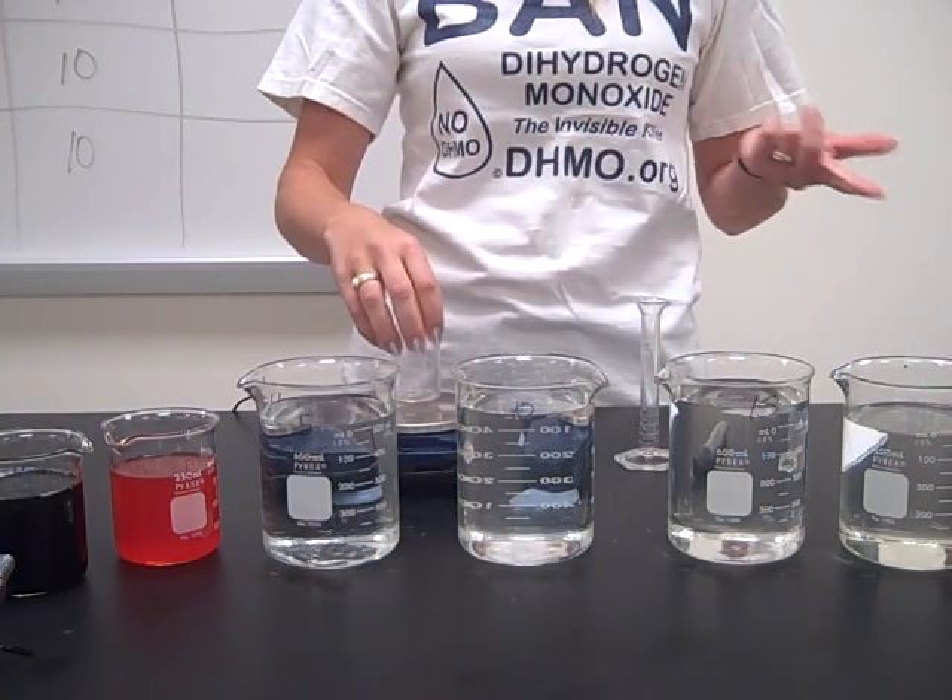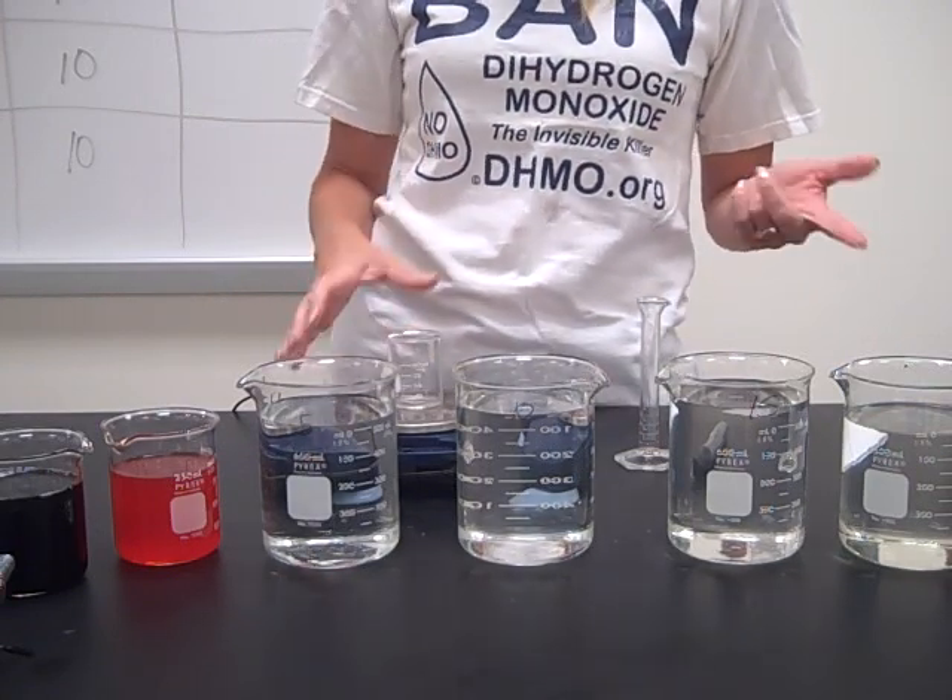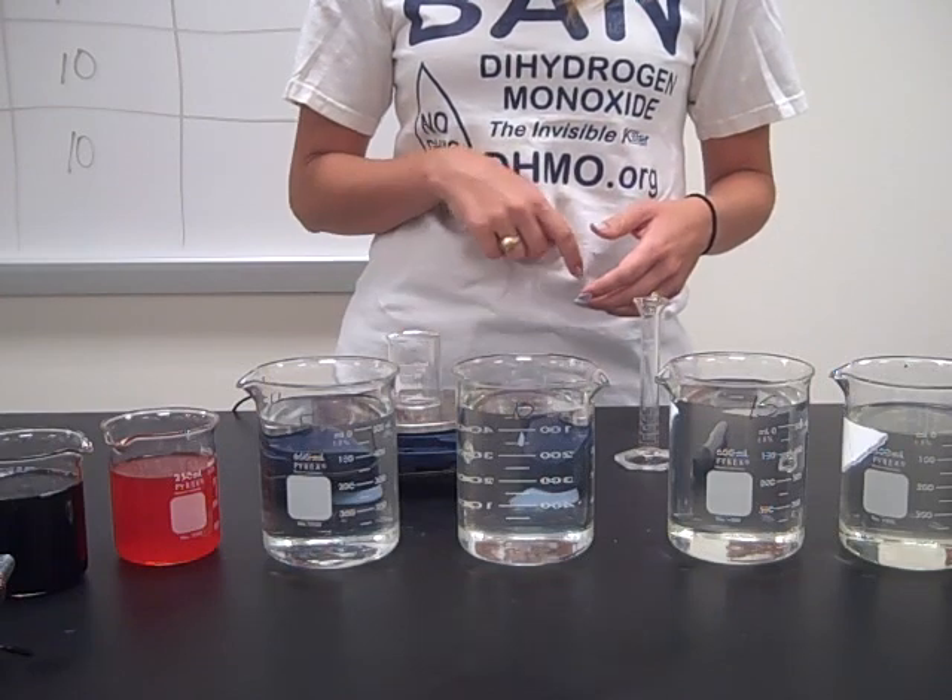Just a little 50 mL beaker. It says in the directions to use a 100 mL beaker, but 50 mL is fine. So I'm going to zero that out.